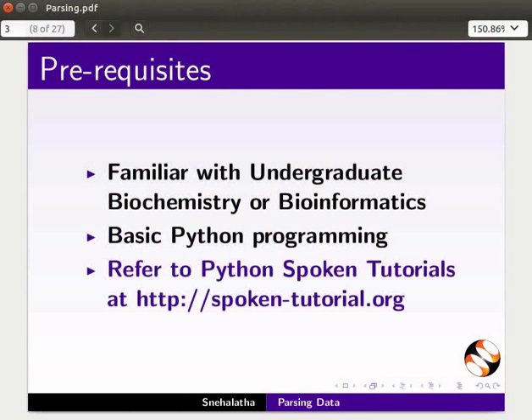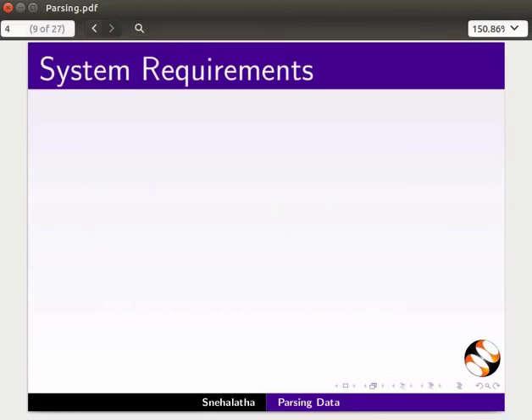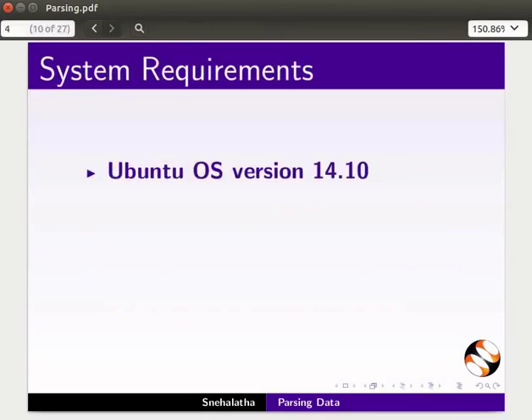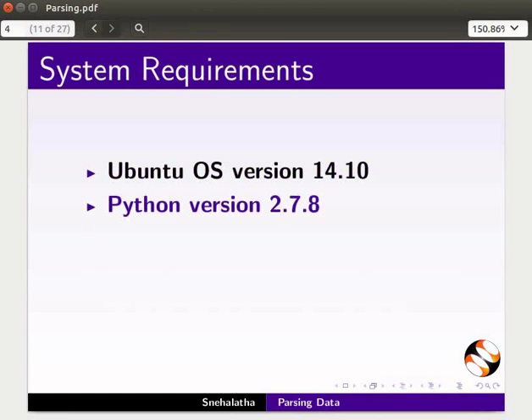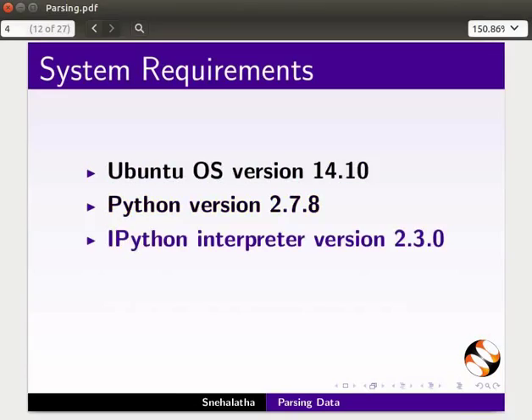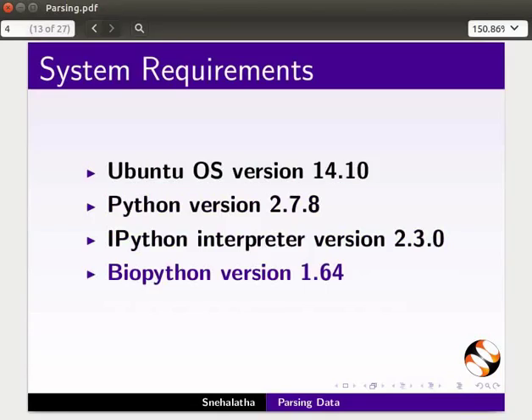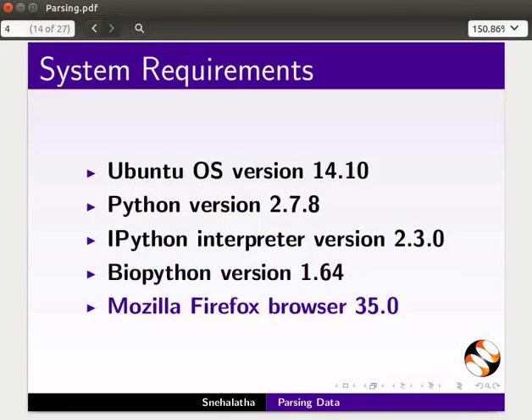Refer to the Python tutorials at the given link. To record this tutorial, I am using Ubuntu Operating System version 14.10, Python version 2.7.8, IPython Interpreter version 2.3.0, BioPython version 1.64, and Mozilla Firefox Browser 35.0.